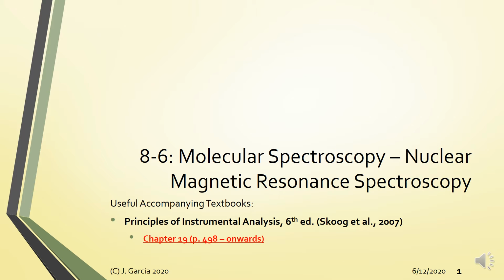Okay, so this is module 6 of part 8. For this module, we will be discussing nuclear magnetic resonance spectroscopy. Now, we will focus more on the instrumentation and some of the basic theories of NMR.